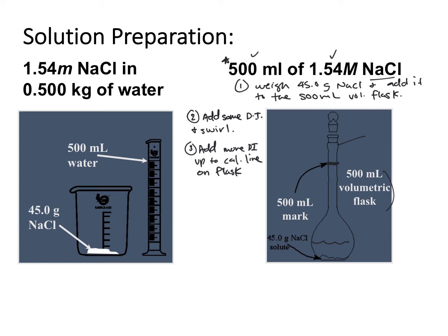Okay, so now let's go ahead and let's look at the preparation of a molal solution. So in this context, guys, all we really care about is the quantity of our solute, its mass, as well as the relative mass of our solvent. Okay, so what we're going to go ahead and do, there's actually two ways you can go about doing this. Okay, first of all, you're going to weigh your solute, okay, and add it to your beaker.